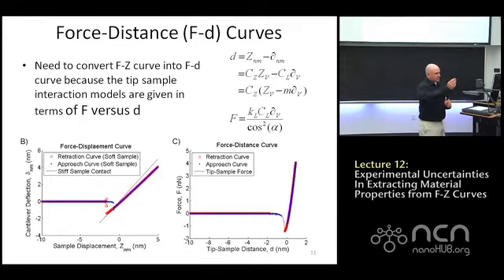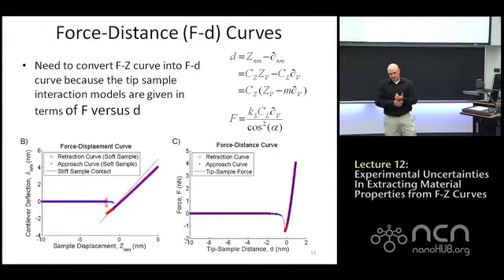You don't have to make any adjustments because you are using a round tip or a pointy tip, like a triangular? For small indentations, definitely not. If you want to talk about very large indentations, then I imagine the situation could become more complicated because the indentation could be significantly different as you move along the tip. But by and large, in 90% of the cases so far, tip geometry doesn't play a role. I can't think of a case where that would be an important issue.